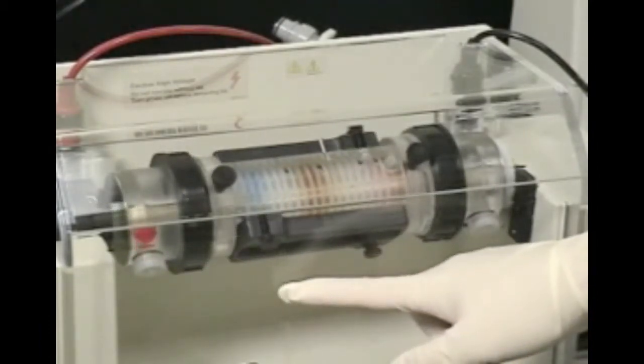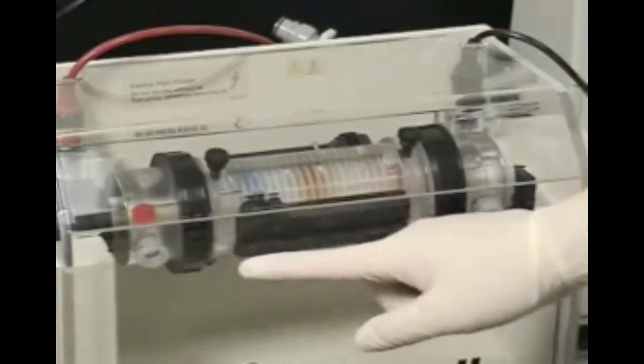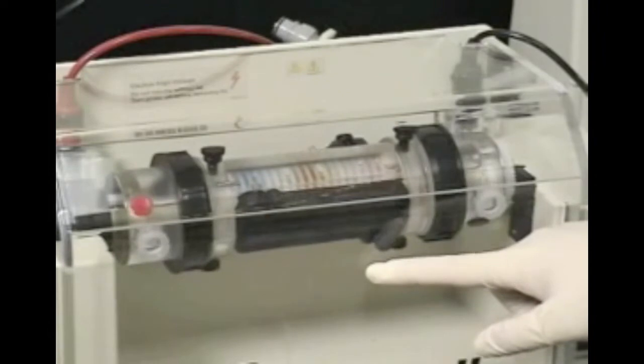After several hours of isoelectric focusing in the rotophore cell, however, these proteins become separate and their individual colors can be seen.